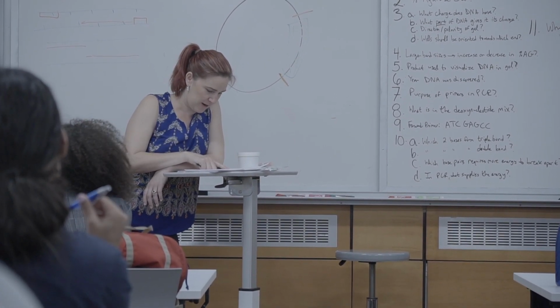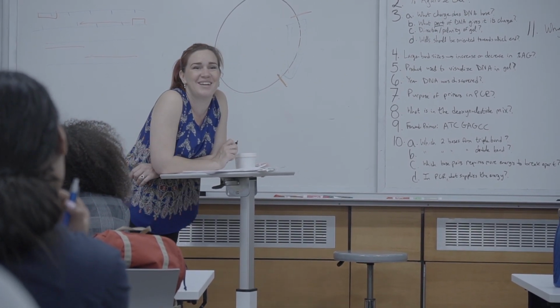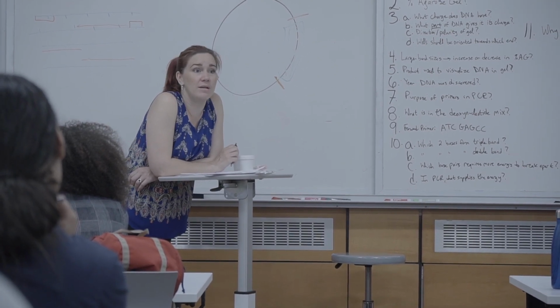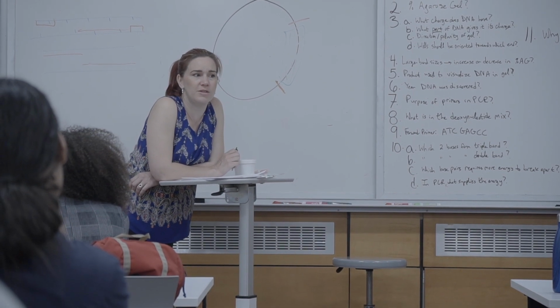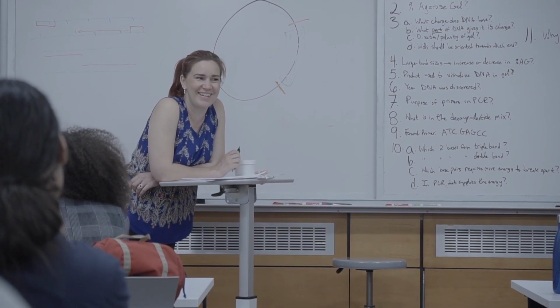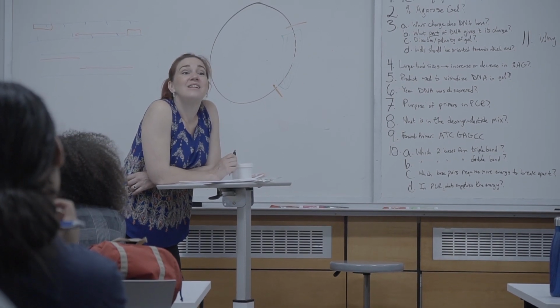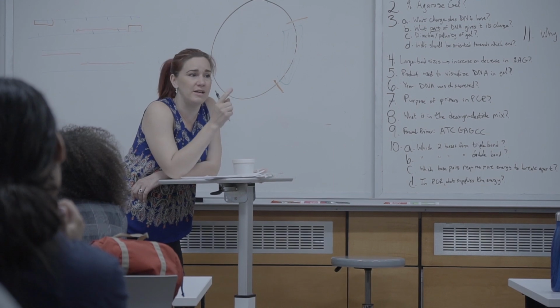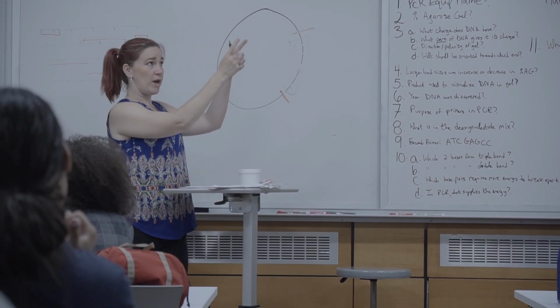Where am I at? Primers. What is in the deoxy nucleotide mix? DNA nucleotide. Yeah, we're kind of getting there. So I heard sugar. The sugar's attached to... partially. Single nucleotide bases, right? So that includes your A, T, C, and G, your sugar backbone, and your phosphate. So they just load in one at a time.